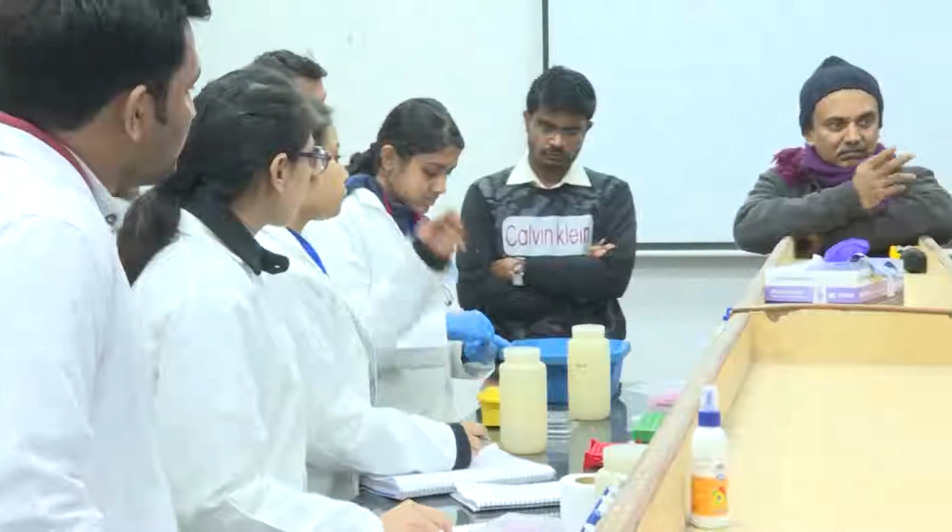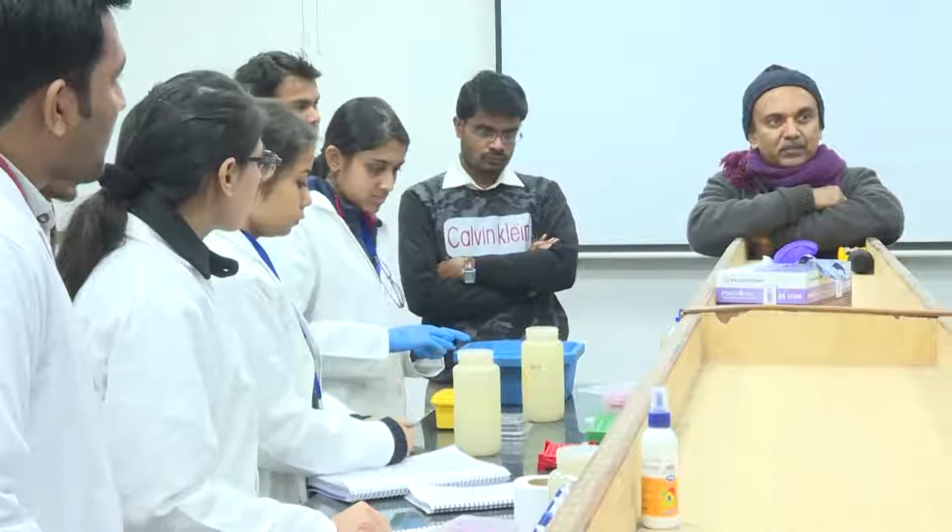I'll just discuss a few points about using absolute quantitation in microbiology. We have all been doing culture-based quantification of microorganisms from several matrices. What we do is take the sample, dilute it, plate it out on a medium of our interest, and then quantify.